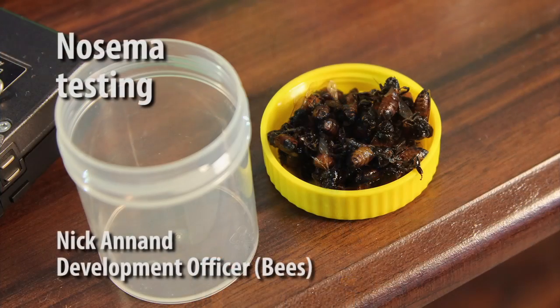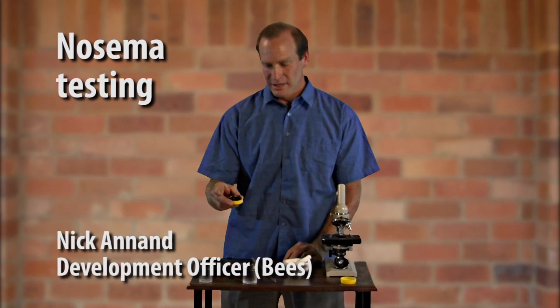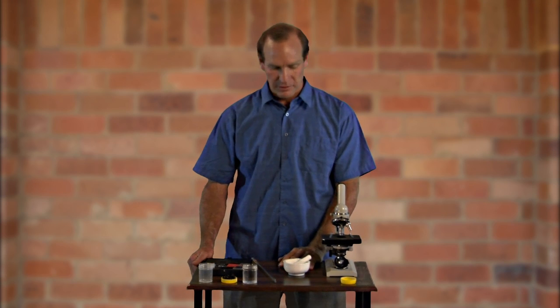The adult bee disease Nosema is a major economic cause of loss for the beekeeping industry. However, it's one of the diseases beekeepers can actually do the monitoring for themselves.